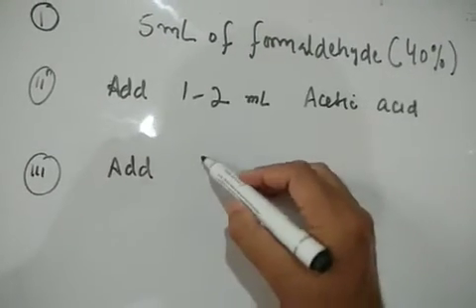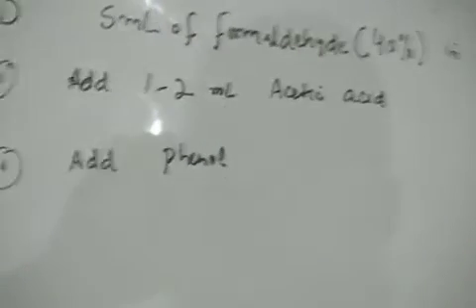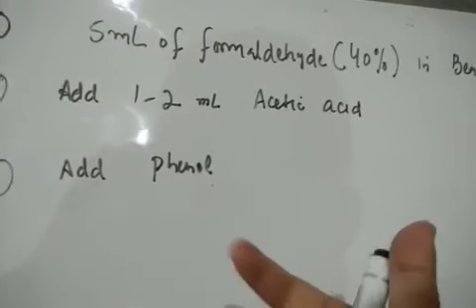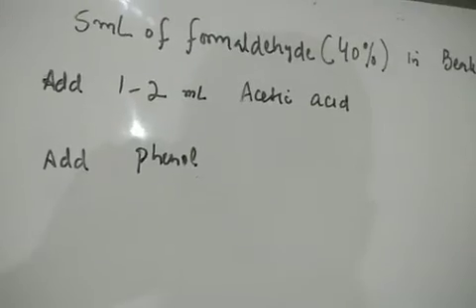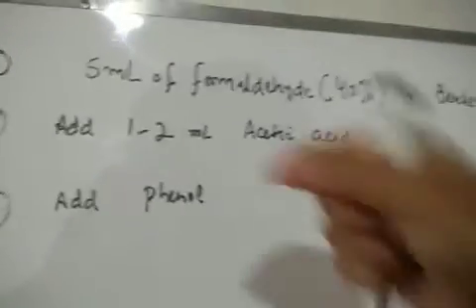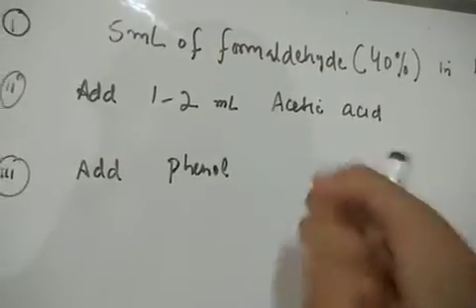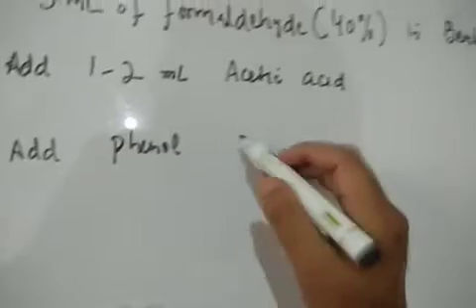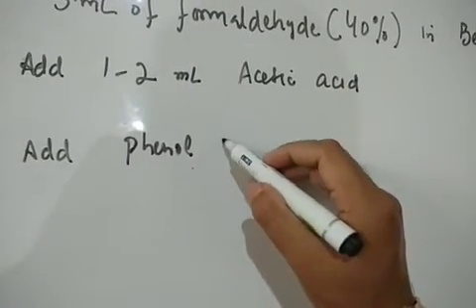your phenol. As you know, it's crystalline in the bottle, available in the market like crystals. It's acidic also because it has an acidic proton, so we have to take care here. We can use the spatula to grind it, take it with the spatula, and weigh that on a balance. And then you can add the phenol to this.